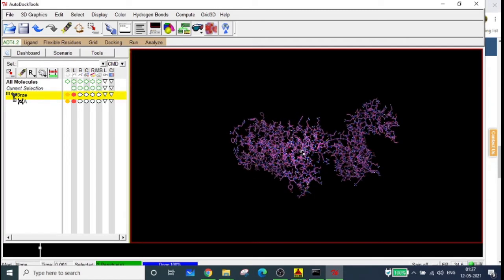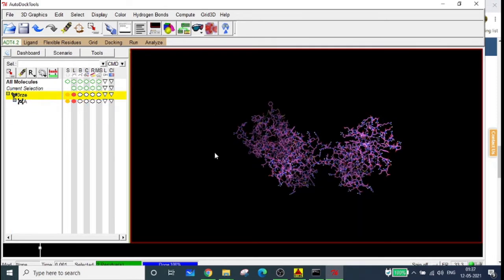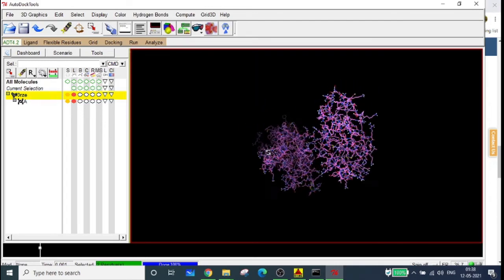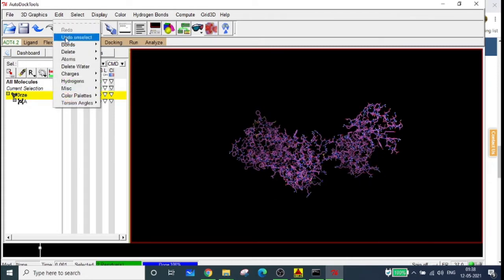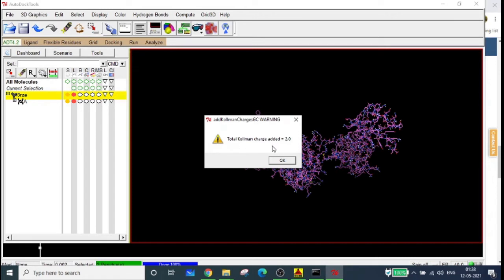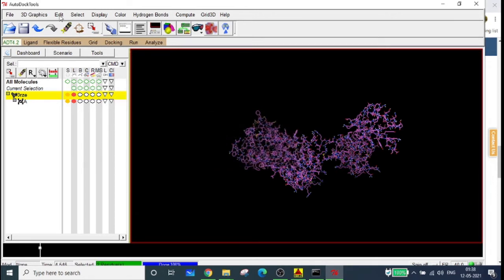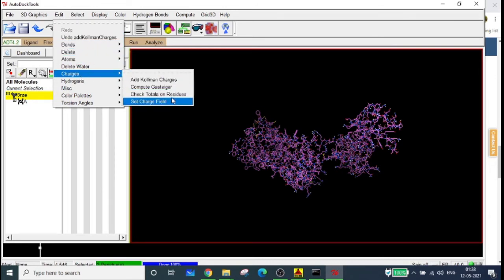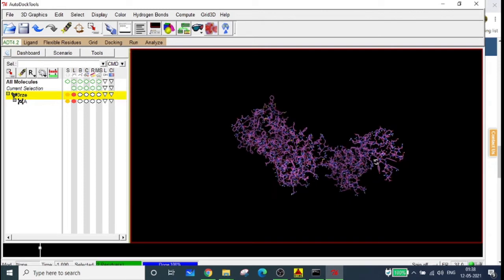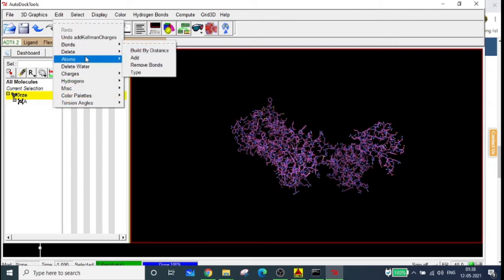Now it is time to compute the charges. Go to Edit > Charges > Add Kollman Charges. The total Kollman charges added is 2. Then go to Edit > Charges > Check Total Charges on Residues. The result shows no residues with non-integral charges — the molecule is ready for docking. Go to Edit > Atoms > Assign AD4 Type to assign the AutoDock4 atom types.